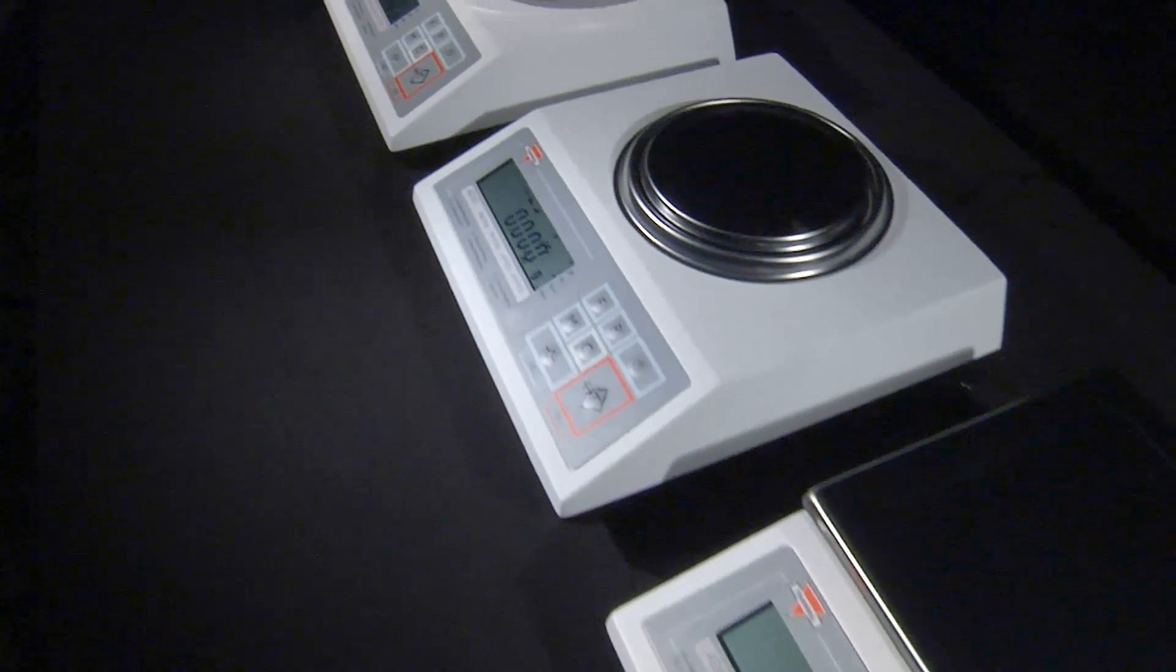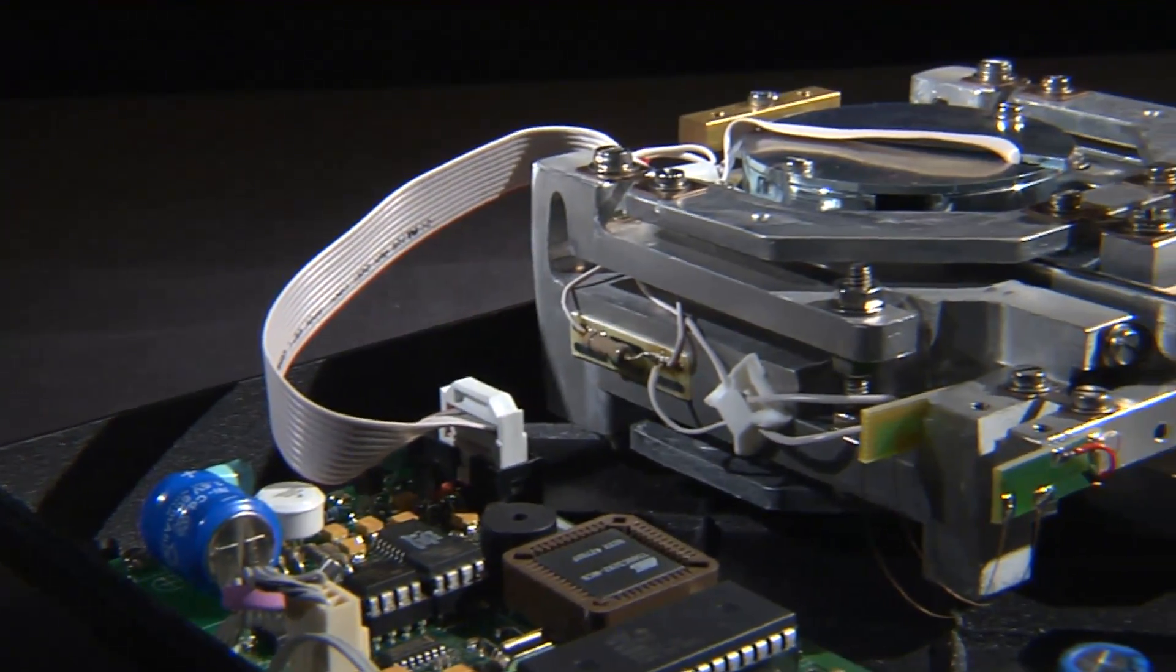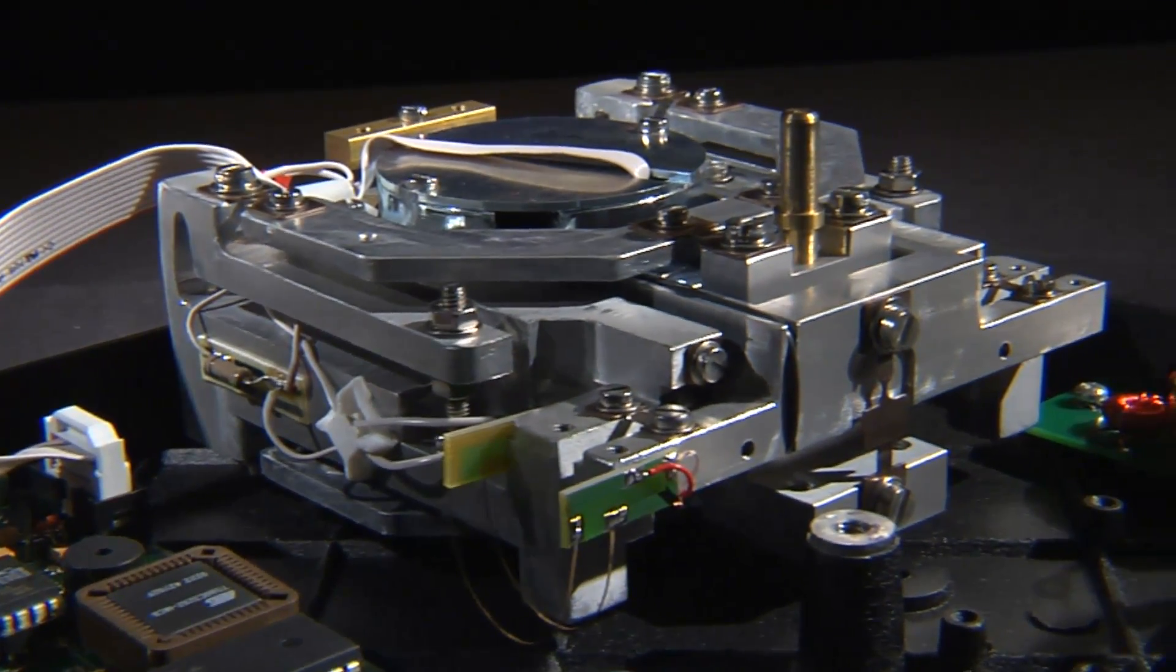Each AD Precision Scale is equipped with an electromagnetic force restoration load cell mechanism that guarantees stable and accurate results at all times.